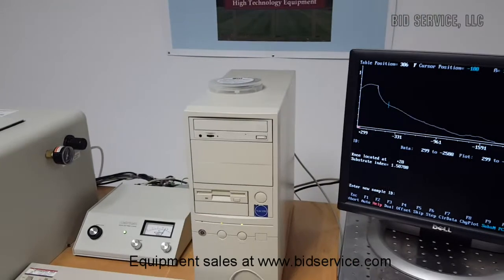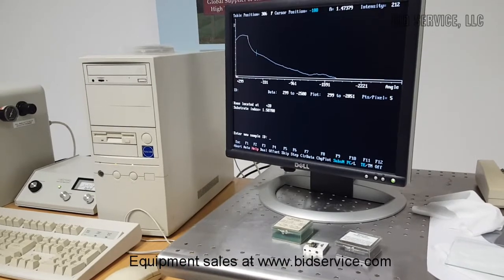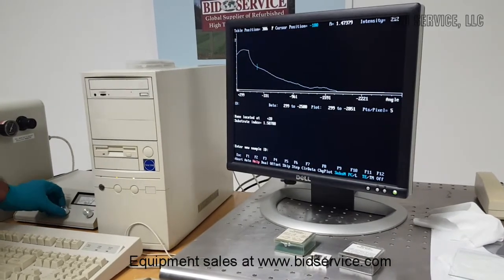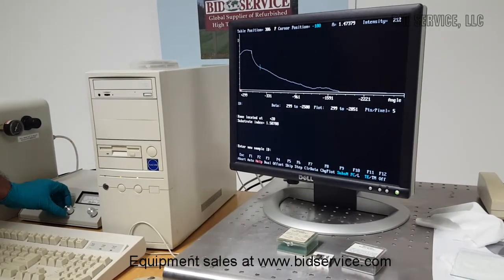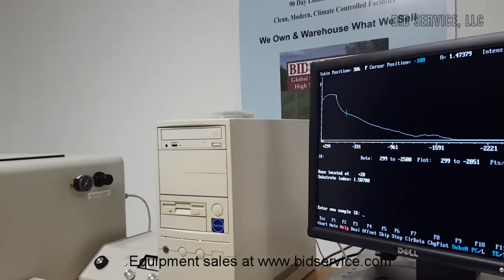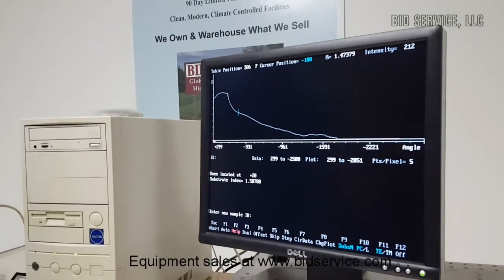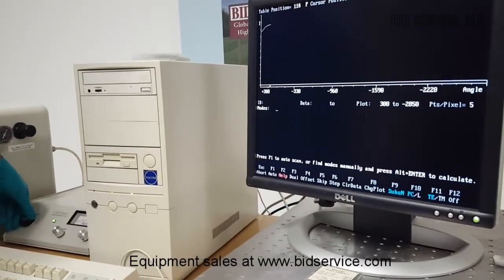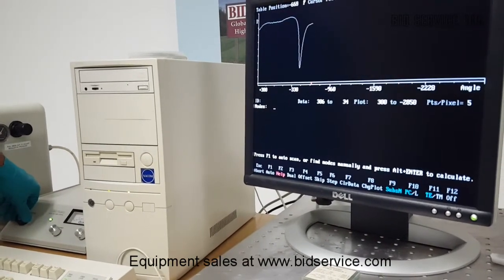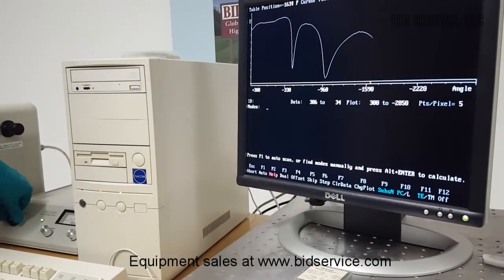So I changed the sample. Now once the print ends, we can do the second measure. Manually I can rotate this knob to the right, and I'm manually plotting it.